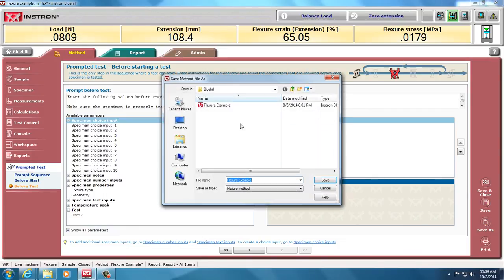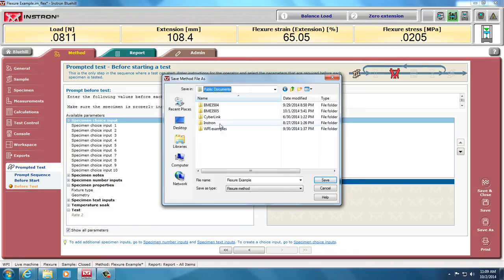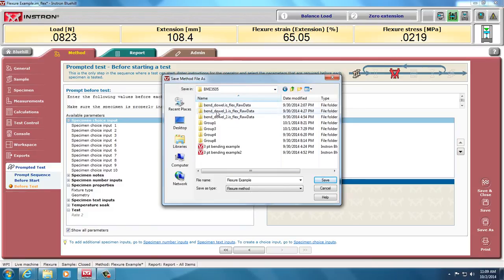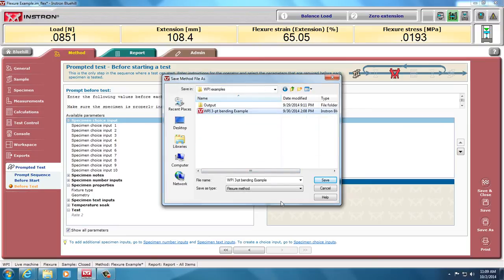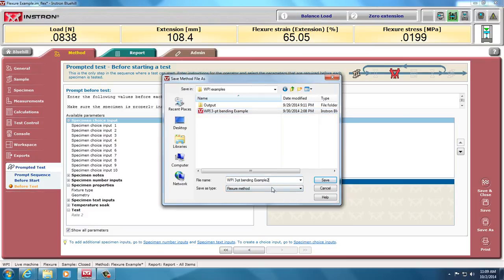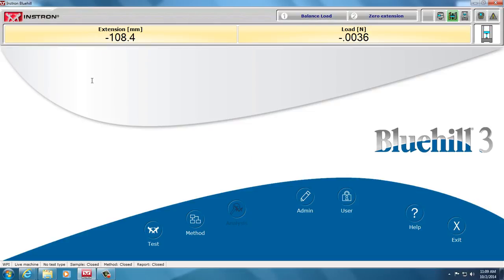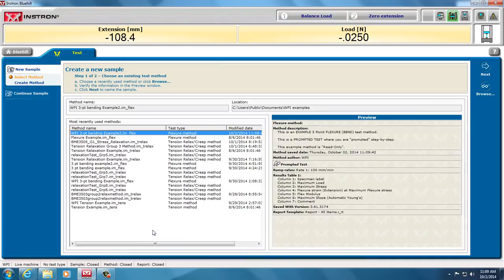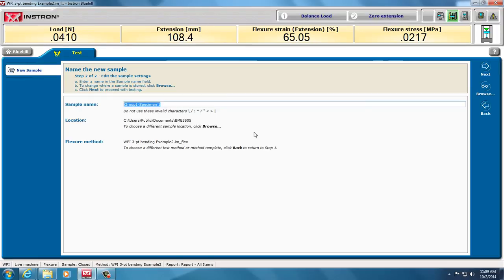I have to save it as. Luckily, that's a write-protected file. I don't save over that. I go back to our documents and our class, and I can save it. I'll save this under WPI example and three-point example. Save it as a new file name to do the test. Go back to Blue Hill, test. There's my test name.